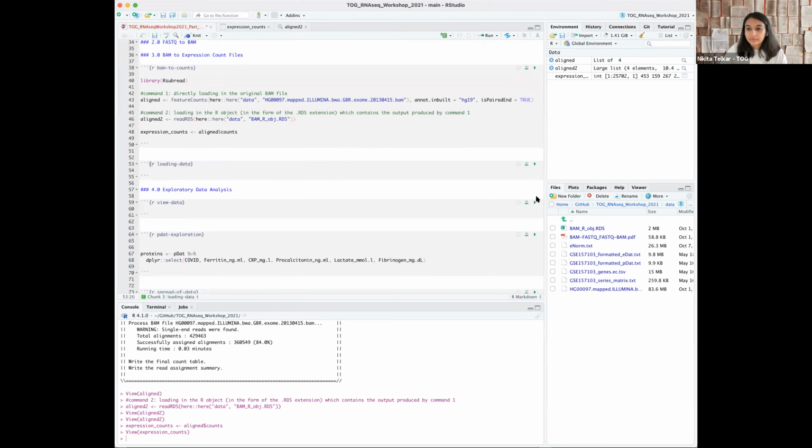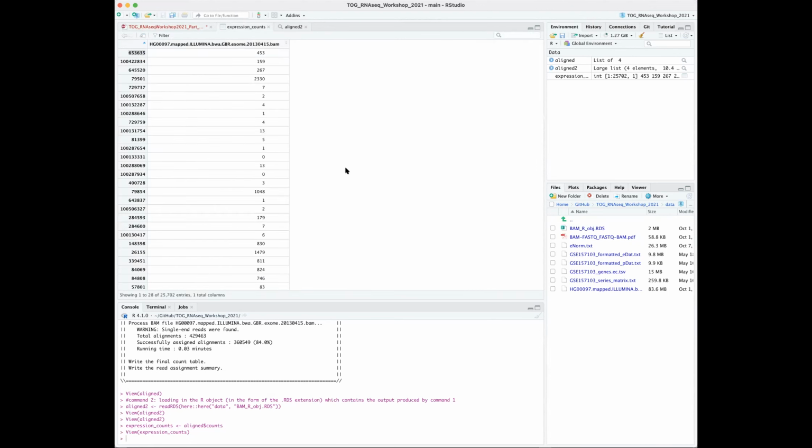So okay, I'll just pause here. Any questions? So, sorry, quick question. Will you have missing data in the counts file, or is the output always clean data so that it can work, or do you have to do cleaning before converting to BAM?